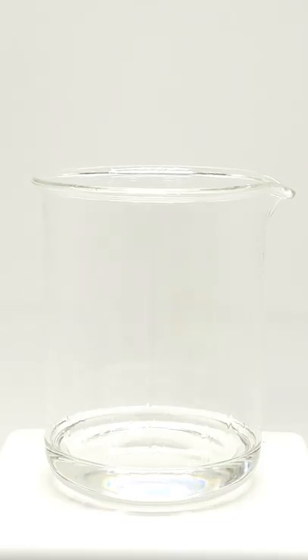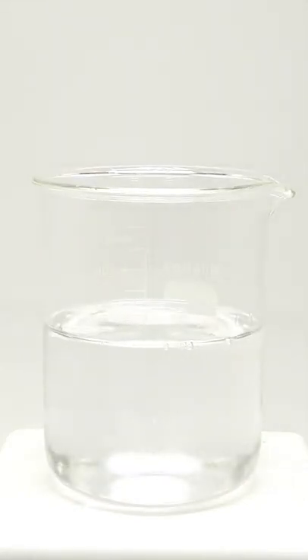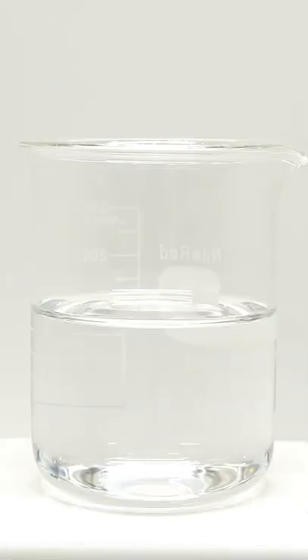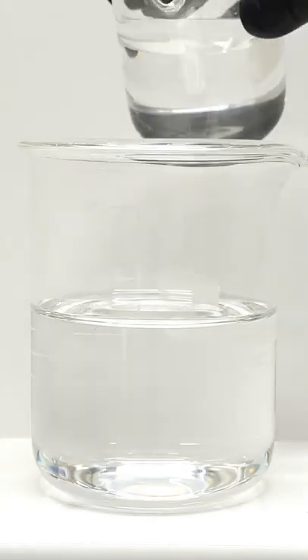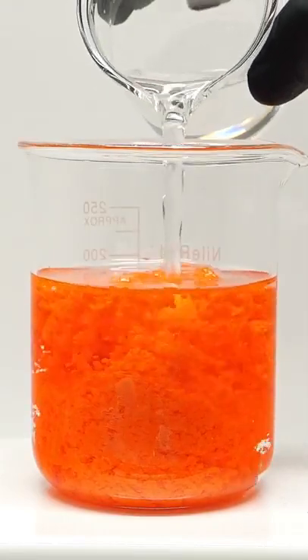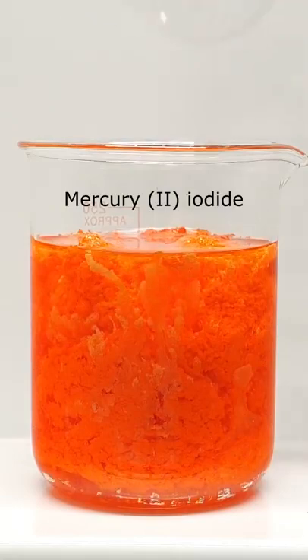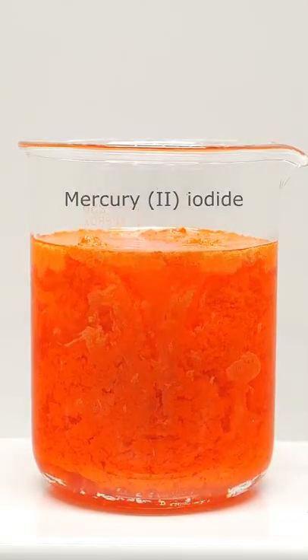What I had now was a concentrated solution of mercury nitrate, and I diluted it with a bunch of cold water. Now I can add the final ingredient, which is a solution of potassium iodide. This almost instantly reacted, and it was turning the mercury nitrate into mercury iodide, which wasn't soluble in water.